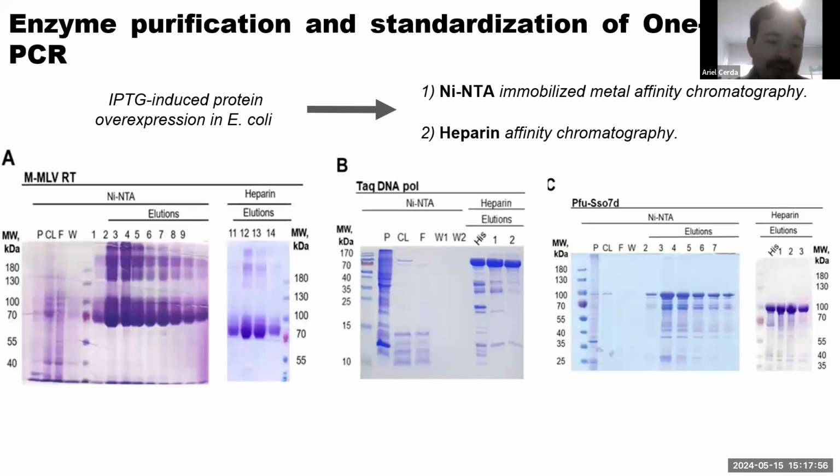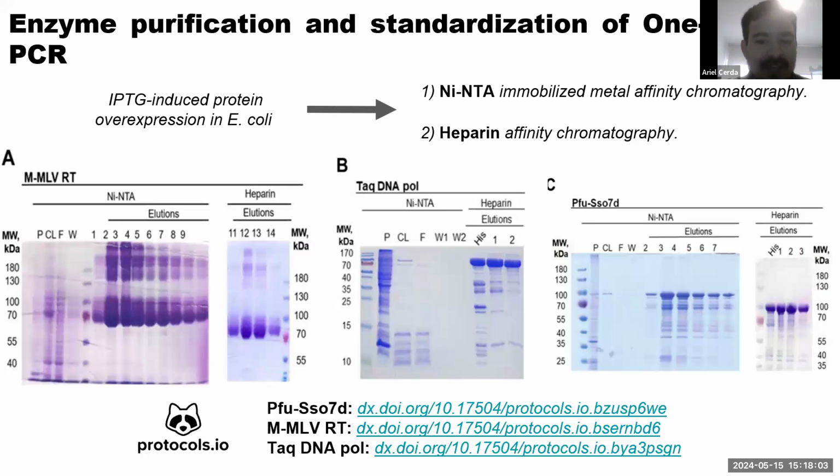Additionally, to support local enzyme production, for this study we provide a detailed purification protocol for each enzyme on the open access platform protocols.io. So if you have any questions about these protocols, they are all available at these links. These links are explicit in our paper.